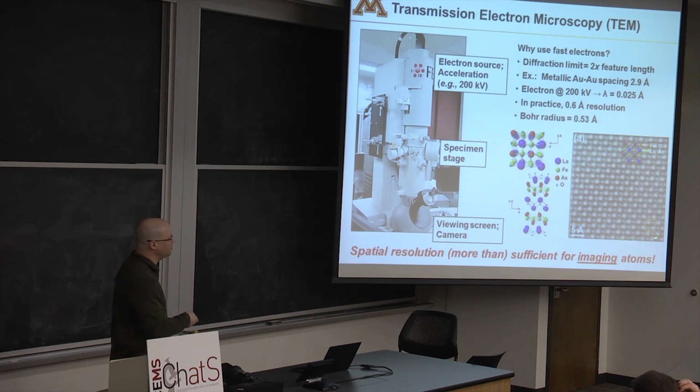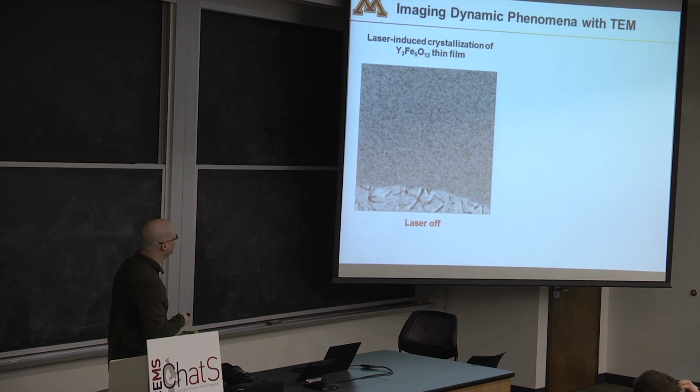I can take static pictures, great, but can I watch these things change and rearrange? Well, let's think about that for a second. So let's first look at the state of the art in terms of time-resolved imaging with TEMs. This is really the best that you can do in terms of time resolution prior to the work that we're now doing.